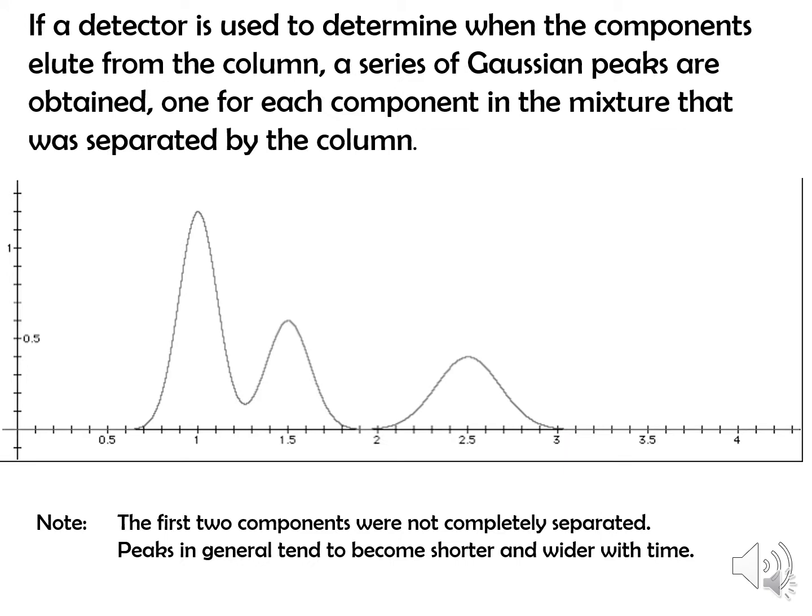So what that's going to look like is this. This is an idealized chromatogram. The result of chromatography, you usually end up with something called a chromatogram. The peak there at the time 1, that's a nice sharp Gaussian distribution. Not total separation with the peak at 1.5. The 1.5 was on the column a little longer, so a little more diffusion, so it was broadened out. And you do not have what would be called baseline separation there, so it's not perfect separation.